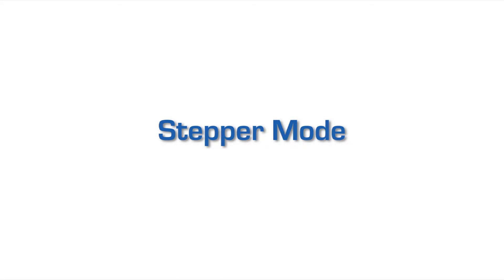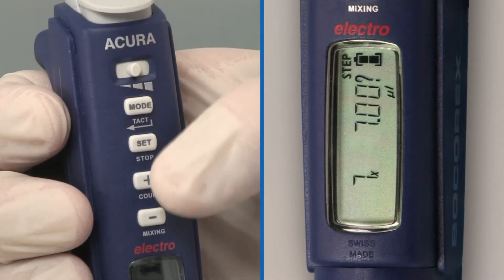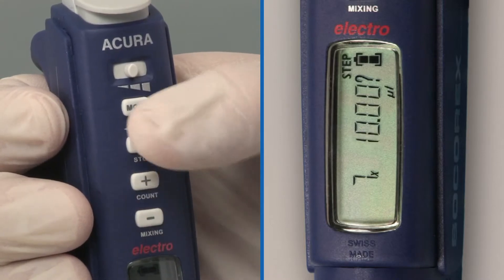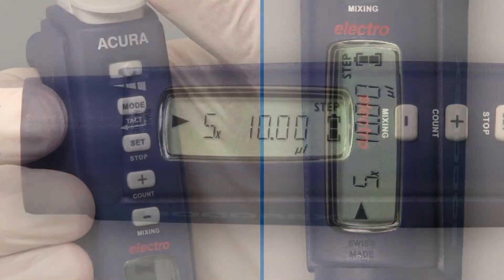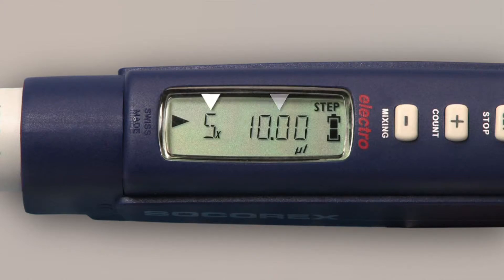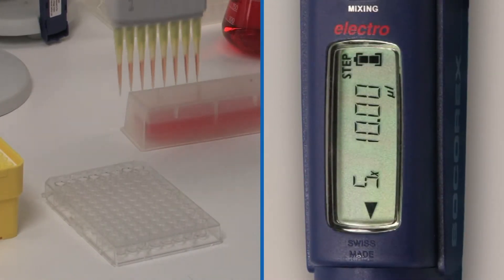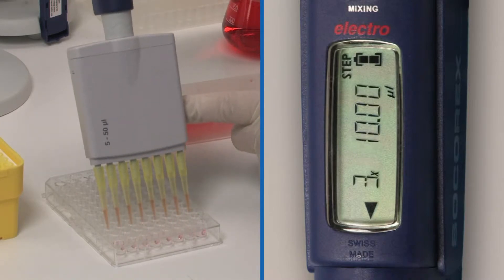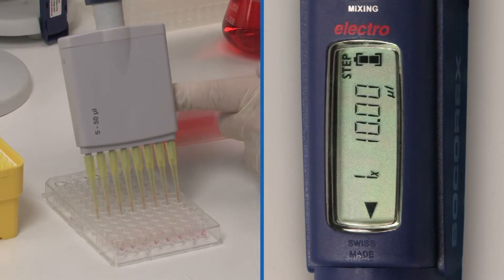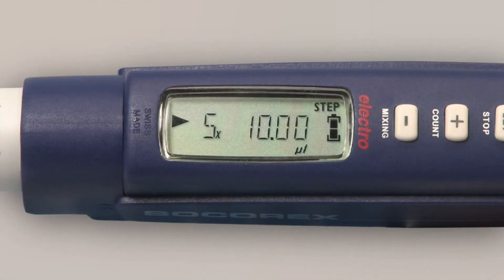Stepper mode enables tip filling and step-by-step distribution. It's best suited to aliquot samples. Press mode several times until the display shows step. Press set to validate, then press the plus/minus keys to display the desired volume for the dosing steps. Press set to validate. Press the plus/minus keys to display the desired number of steps, then press set to validate. The display shows the selected mode, volume, and number of distributions. Aspirate the liquid; each action on the start button distributes one aliquot. After the last dispensing, the display shows purge. Double-click on the start button to eliminate the residual liquid.